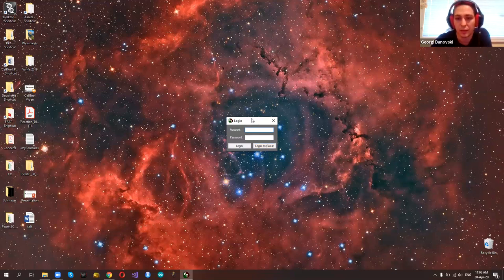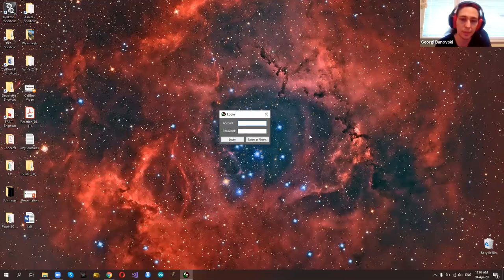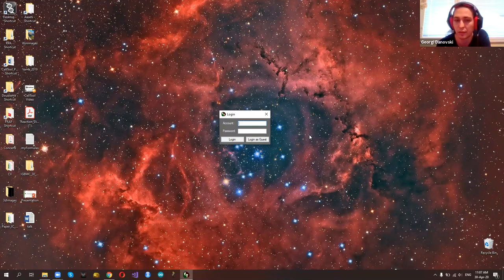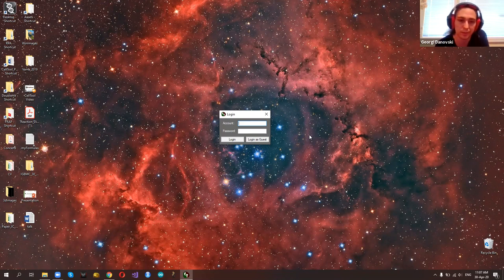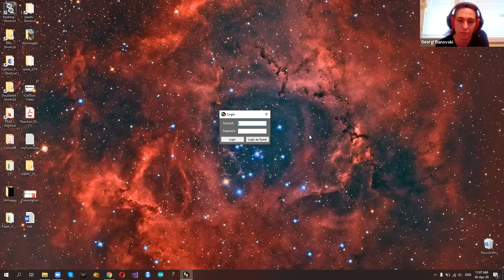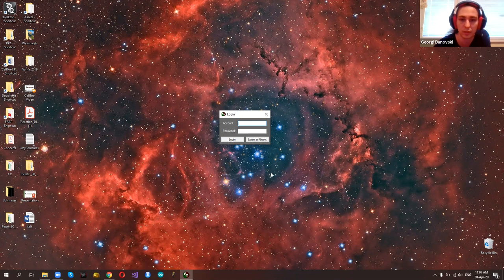Our software has a multi-user password protected interface that is under the control of an administrator. Only the administrator can create new accounts, which are created locally on the machine and not sent to us. Every user can set up protocols and their interface, and this information is stored in these protocols. This is particularly useful when the software is installed on a common machine in imaging facilities where many users share the same computer. If you're using the software on your own machine, you can simply log in as guest.